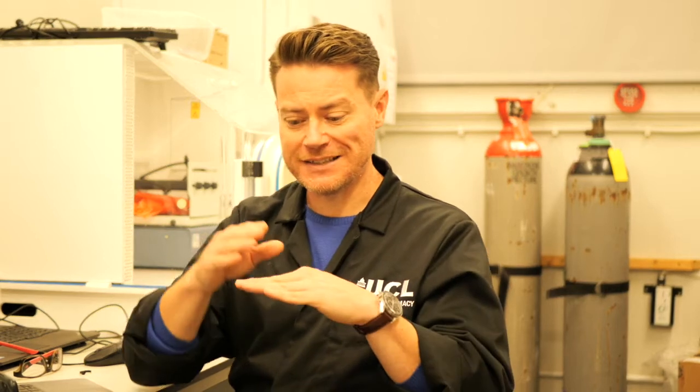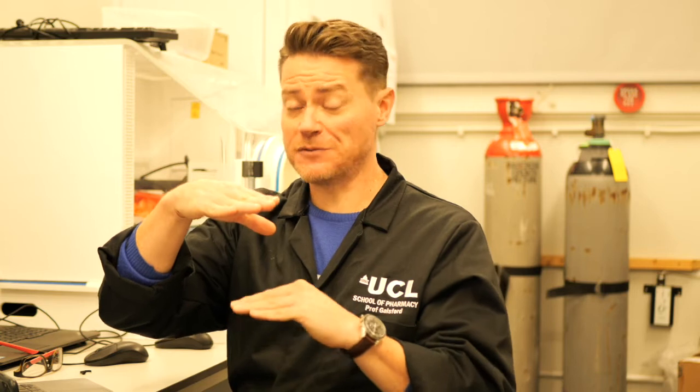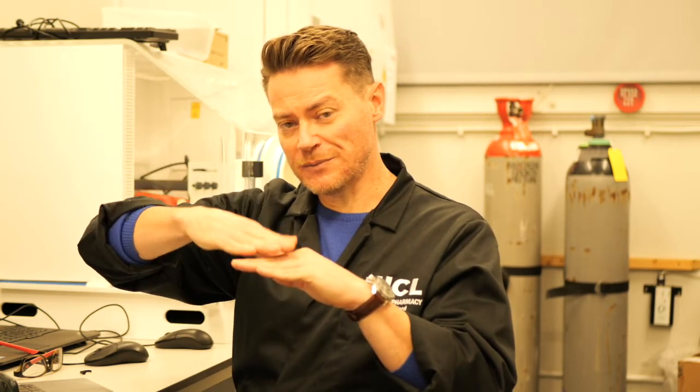Now what that means is, depending on where you've got your lenses, the top of your sample can be in focus, but you'll find that the bottom is out of focus. Similarly, if you change the lenses so that you put the bottom of the sample in focus, the top becomes out of focus. So it's got a very narrow depth of field, and you only have one part of your sample in focus at any one time. So that's a little bit tricky. So the images on the screen are showing you the same sample, but with the lens at different positions in that sample.